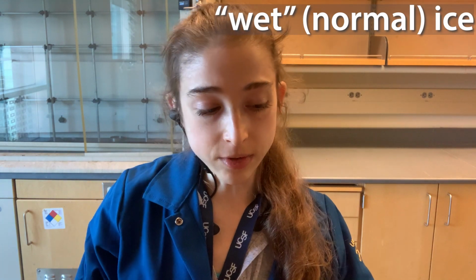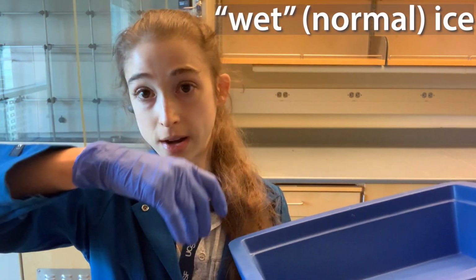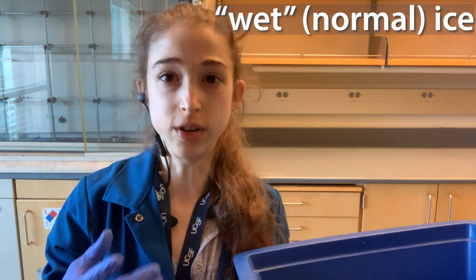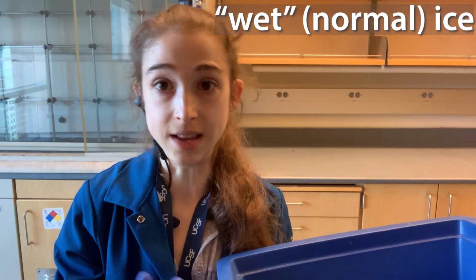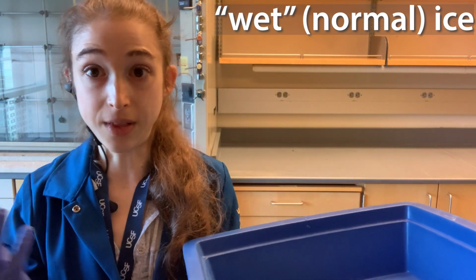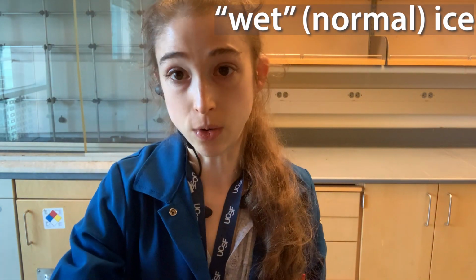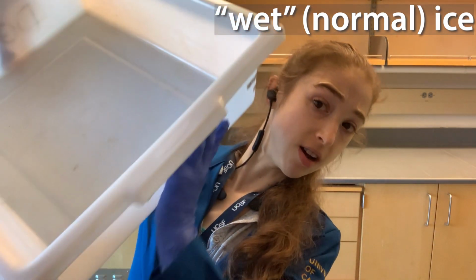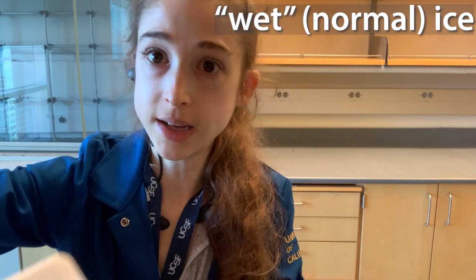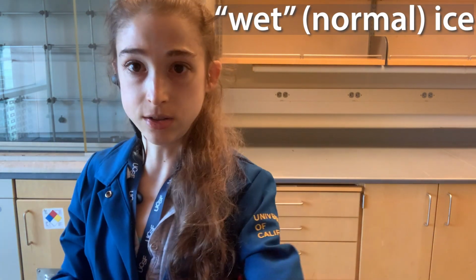If you have really large samples, like cell culture bottles, maybe you're doing an induction or you're harvesting your cells, you need to take these giant culture flasks and stick them on ice. They make giant rectangular ice buckets, or if you don't have one of those, you can just use an autoclave tray, fill it up with ice, and voila, you've got a large surface area of ice to work with.